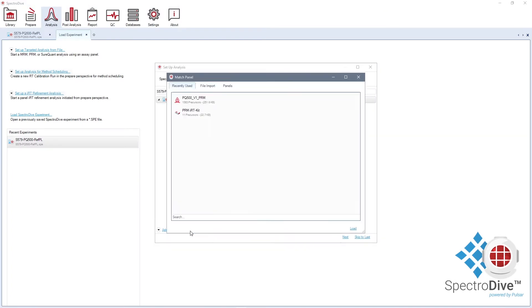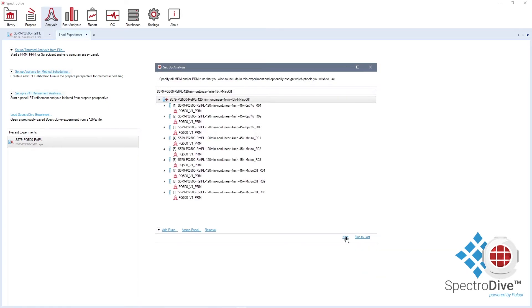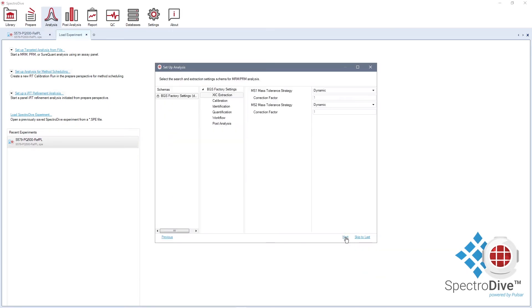Secondly, choose your assay panel. In the next step, you can customize analysis settings. BGS Factory settings are SpectroDive default settings applicable to most PRM experiments.